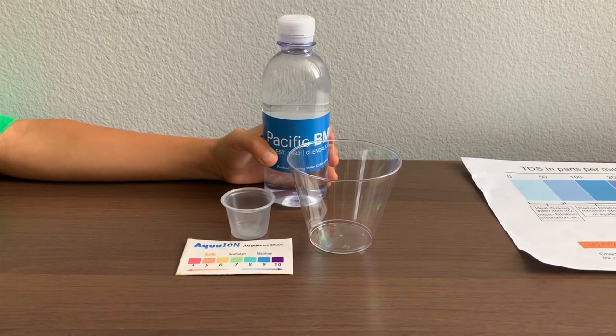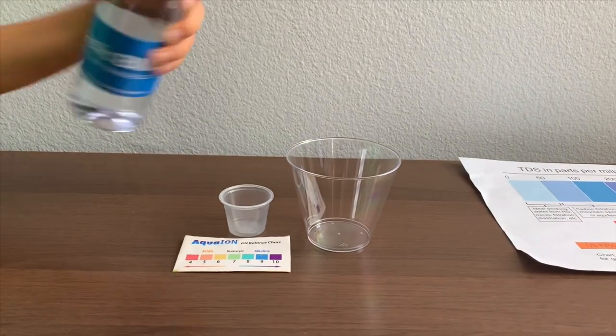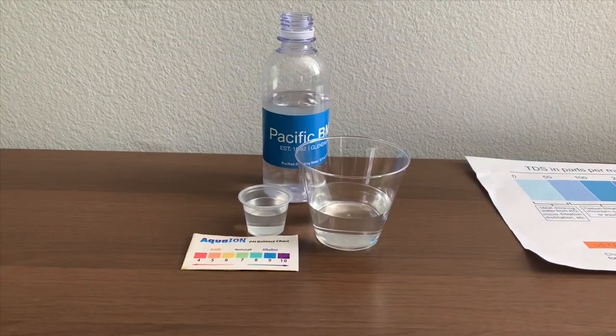Let's test the pH and TDS levels. Let's pour some water in. First, let's test the TDS level.